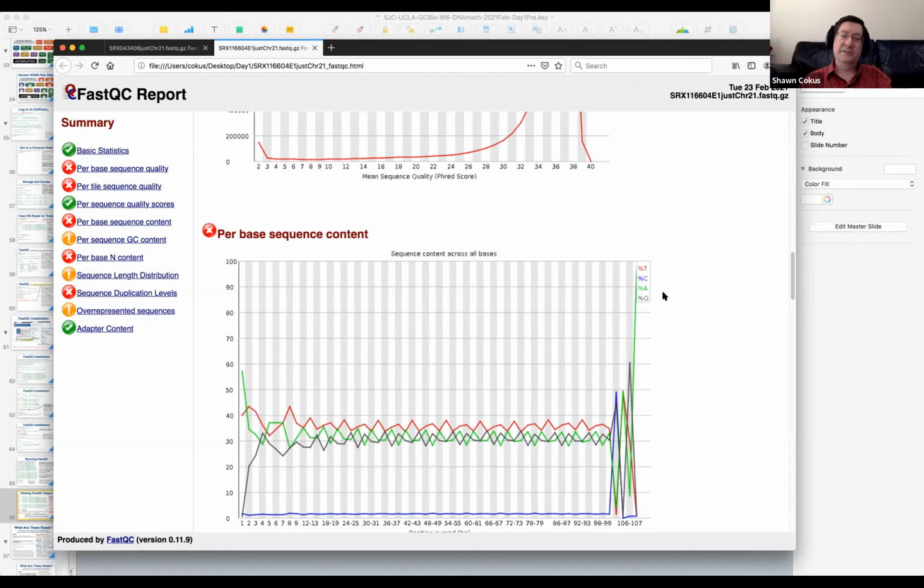In mammals, you're more concerned about CG methylation, which is more of an on or off thing, and not too bad. If you're in plants and dealing with CHH methylation, that's your concern. That's maybe only 5% when it's high, so the particular little contaminants in the methylation files start to be a big fraction of the methylation signal there. So in mammals, 80 versus 100 CpGs is probably okay. Okay, thanks.